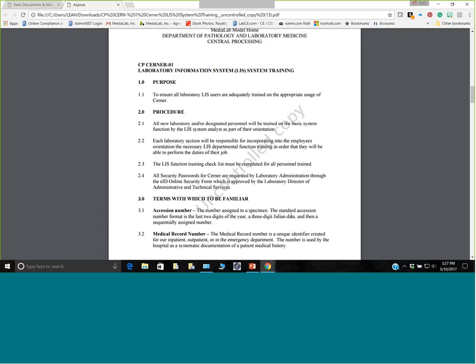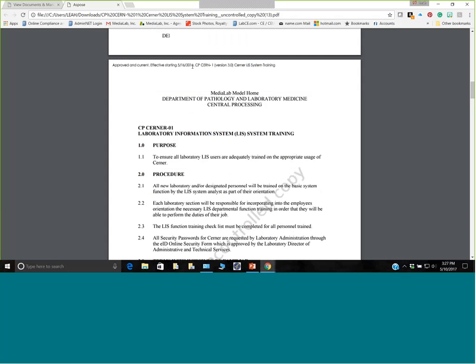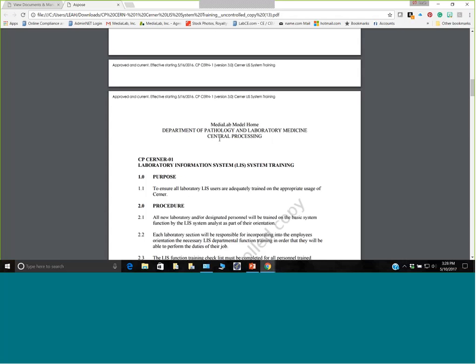You can customize your headers and footers with us, which is a nice, fun feature. If you wanted to add your logo or add something fancy, you can certainly do that. You can also add additional placeholders if you'd like for some of that data. But we are going to update this for you in real time as changes happen in the system and your version changes. We'll make sure that your headers and your cover sheet does too.